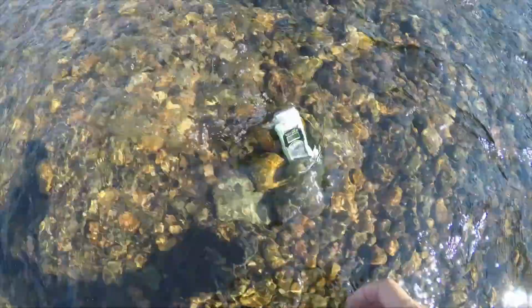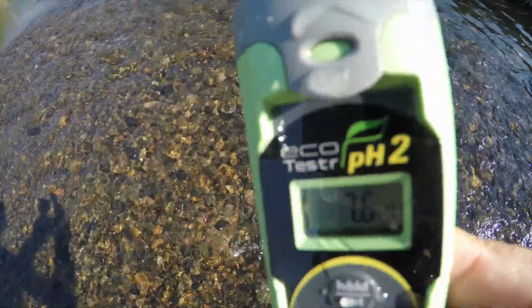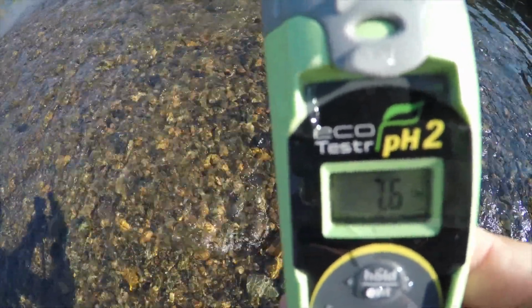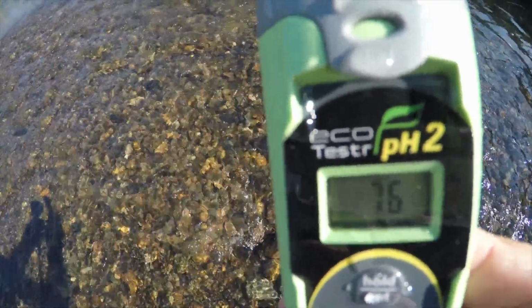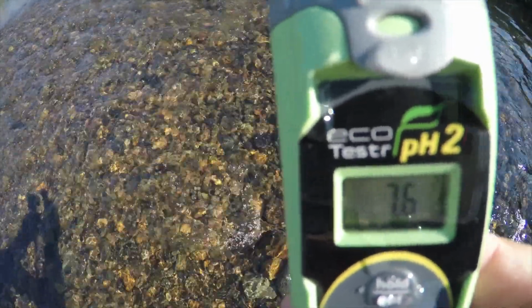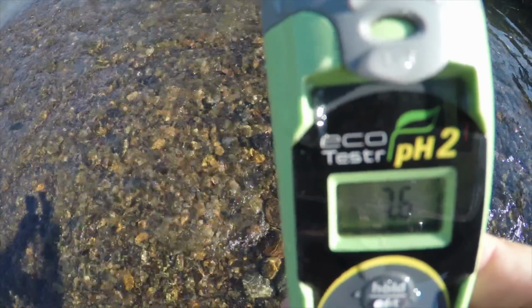Alright, we have our probe soaking. Let's pull it out and see what our pH is. Looks like 7.6. So slightly above neutral. That would mean it is a base, and we are very close to 7. 7.6, so just 0.6 higher, which means we have a very, very good pH today.